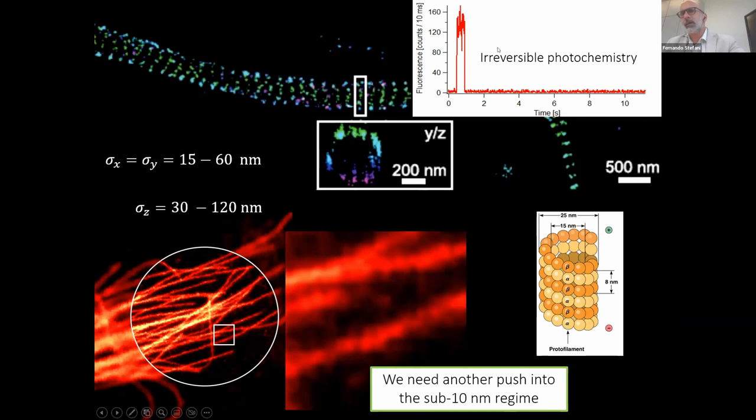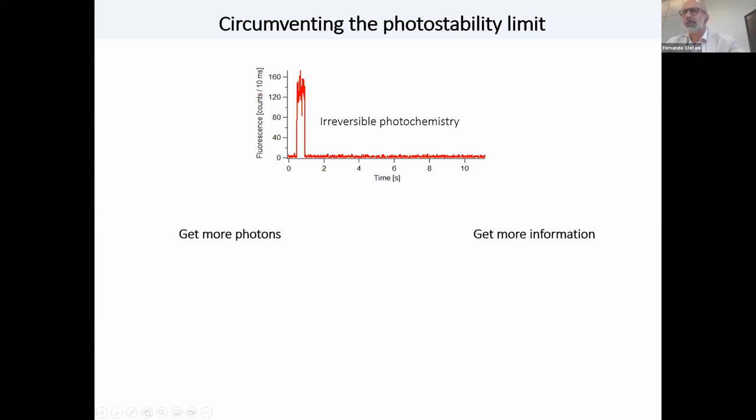And the problem, the reason why we cannot get farther is irreversible photochemistry. So the fluorophores that we use, we want them to be excited with light and to emit a fluorescence photon after that. But sometimes they use that extra energy to undergo an irreversible photochemical reaction. And then the experiment is over. Here you see an example of a single molecule trace. They emit fluorescence up to some point and then they photobleach. So this limited photon budget that we have is the reason for the limitation in resolution of these techniques. So to circumvent this problem, there are obviously two ways. You either get more photons from a molecule or you get more information from the few photons that you have available.